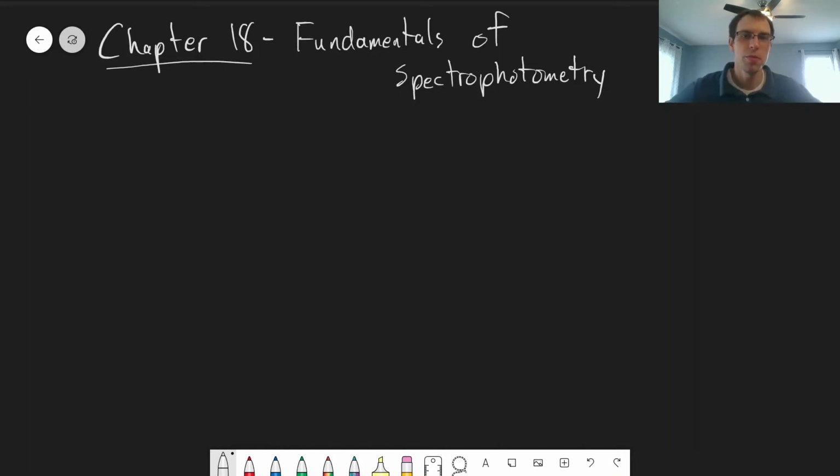Hello, and welcome to our set of videos for Chapter 18 on the fundamentals of spectrophotometry. So this is the beginning of our final unit for our class. We've looked at doing volumetric measurements, titrations of various kinds: acid-base titrations, precipitation titrations, EDTA titrations. We've also looked at using electrochemistry to do analytical measurements. And in this last unit, we're going to be looking at using properties of light to do analytical measurements.